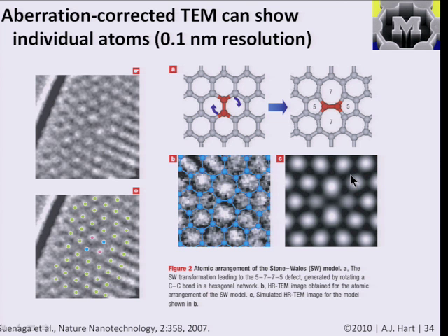And so these images just show here they're taking a high-resolution picture of an individual carbon nanotube and trying to pinpoint the placement of the individual atoms in the hexagonal lattice. And this doesn't look exactly like a hexagonal lattice because of the way the tube is curved, but basically what they've done here is they've mapped out what they show is a defect in the structure, and here they showed the existence of this so-called Stone-Wales defect, where instead of 4 hexagons, you have 2 pentagons and 2 heptagons, and we'll see another flavor of that when we start talking about mechanical properties next week.